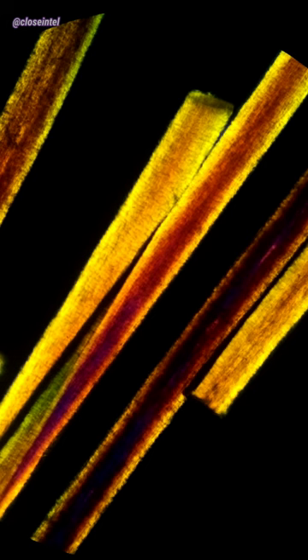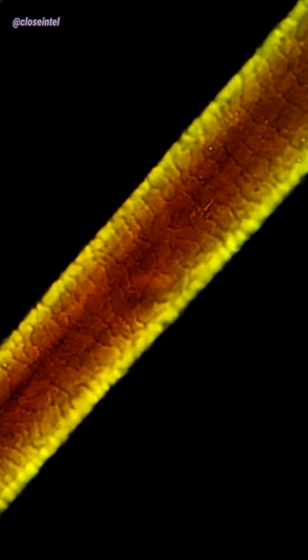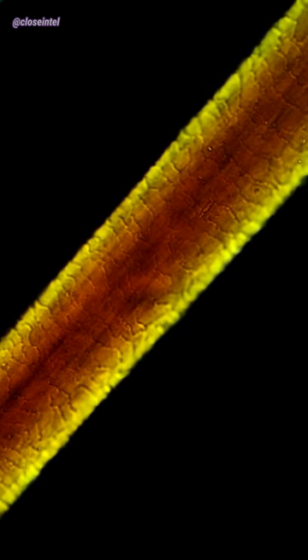The different colors along each strand is representing the stress bends in the hair from being in a different position in the polarized light. As we start to zoom in closer, you can see that the strands are starting to look kind of rigid.